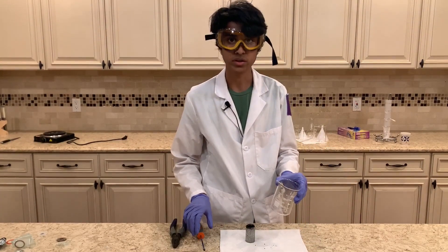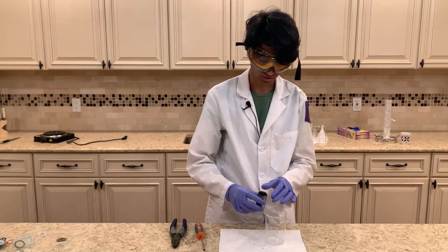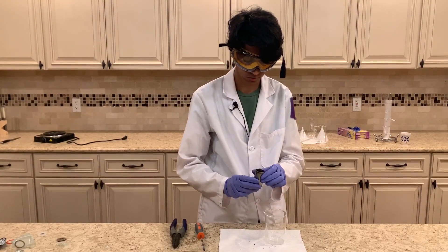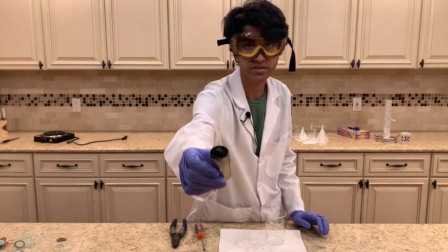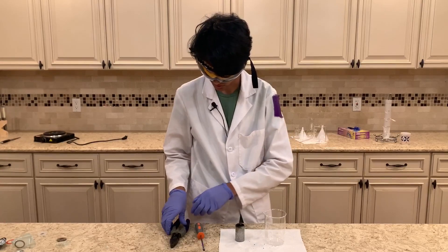I got the beaker out because when we're taking out the carbon rod, some of the manganese dioxide will start coming out. As you can see you can already see it, but it'll be way easier to take it out once we remove the carbon rod.